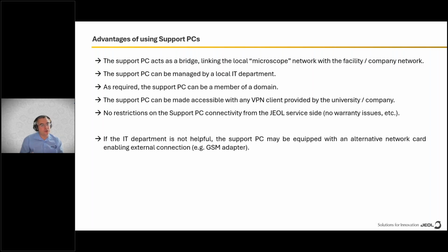Again, to get there, the first thing that has to happen is you normally need to log into the support PC. And this is the one that has to be accessible. It has to be exposed to the wider internet.